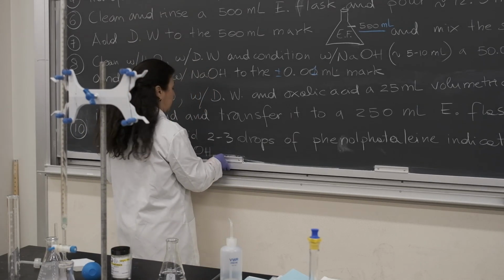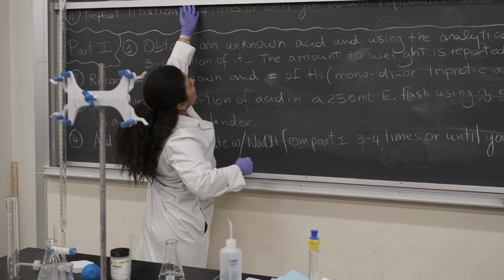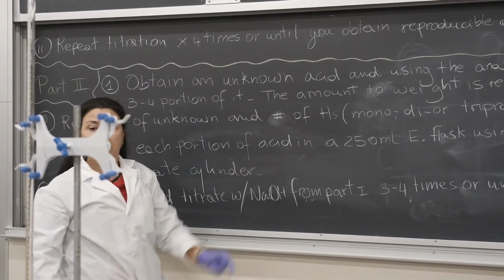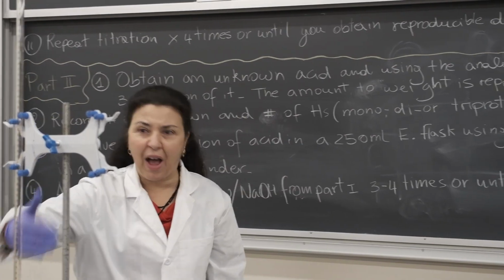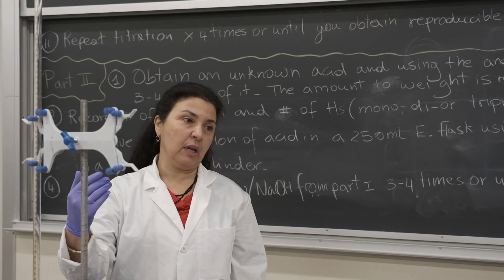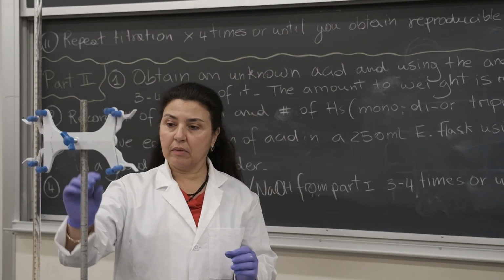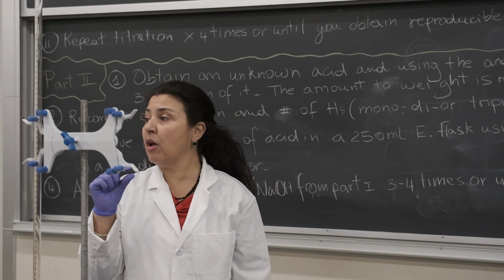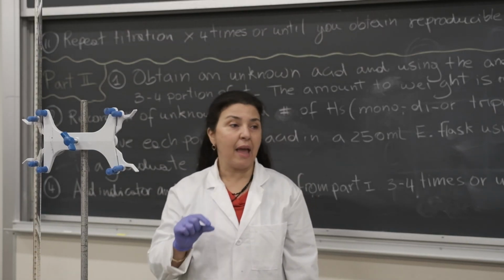So once you perform your titration, here I wrote four times. The very first titration is called the dirty titration. You go fast to figure out where your equivalence point, or your end point, I should say better, of your titration is. Then the other three are going to be fast at the beginning, but for the last one or two milliliters you go very slowly so that you reach the end point of the titration as accurately as possible.